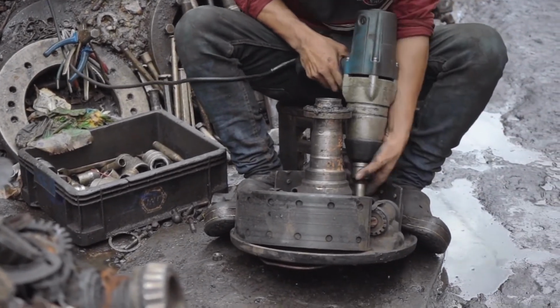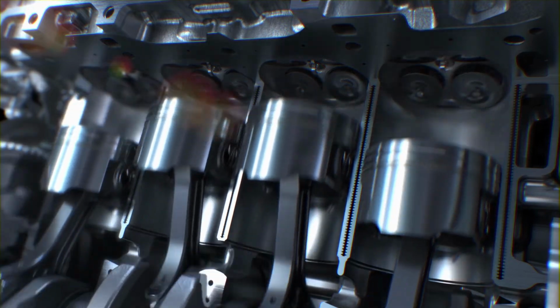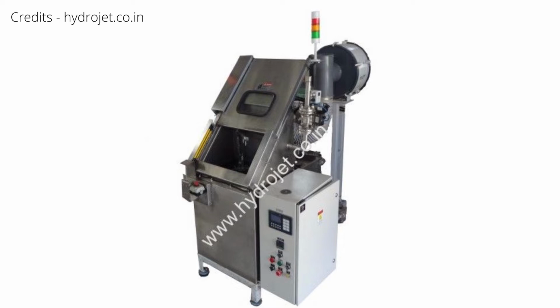Now, why is cleanliness such an important part? Well, if the parts that are supplied to a car manufacturer or that go into a car are not clean, it can lead to a lot of inefficiencies. Maybe the engine wear may be higher over the years, or there may be safety concerns when finally these components go into the assembly. So in order to achieve this Millipore value, auto component manufacturers install component washing machines on their shop floors. Millipore testing can be used to understand how those parts washing machines are working and whether the finished components are adhering to the quality standards set by their customers.